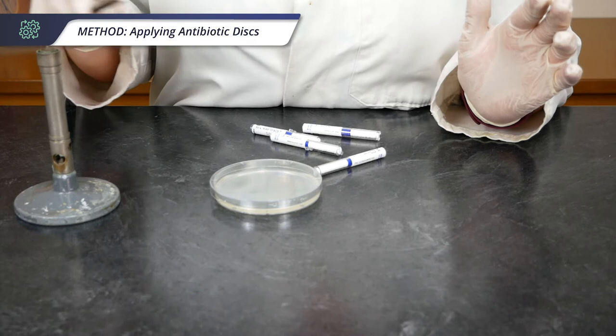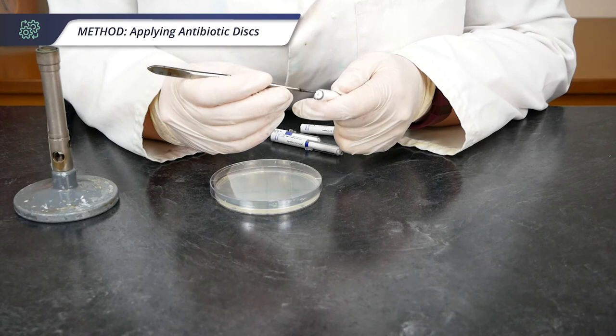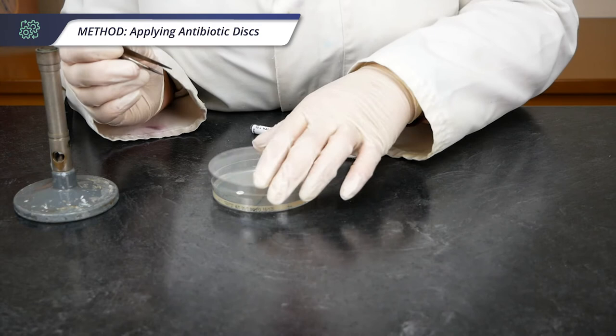The second method is with the use of forceps. Between each use we'll pass them through the Bunsen burner flame to make sure there's no contamination. Here I have chloramphenicol, so I'm just going to pull out one of these chloramphenicol discs and pop it in the segment marked C.